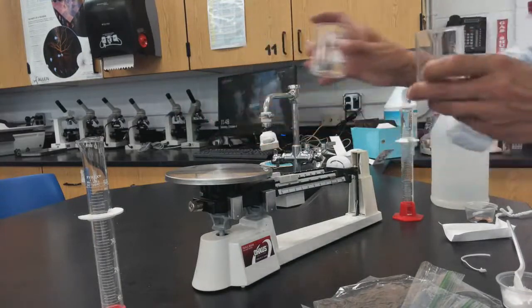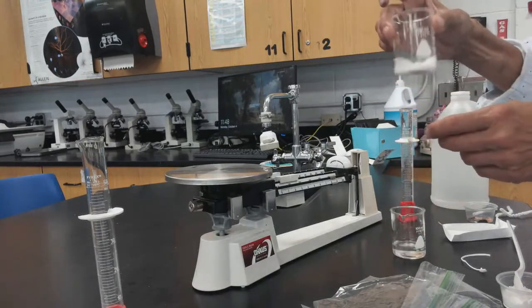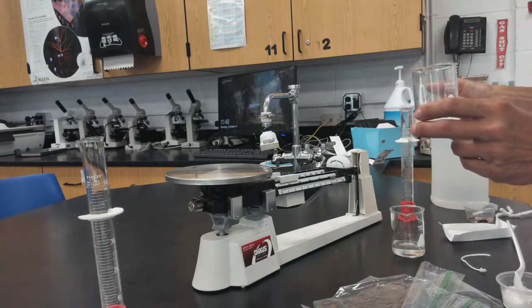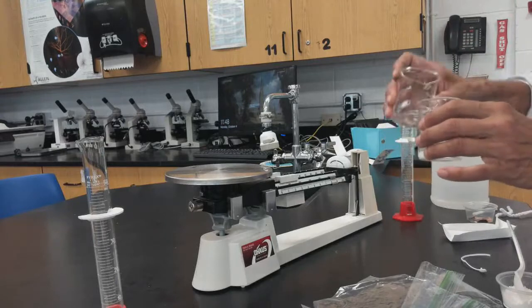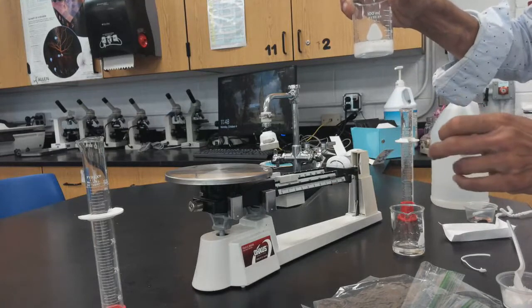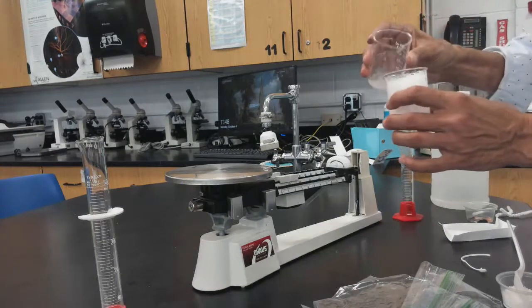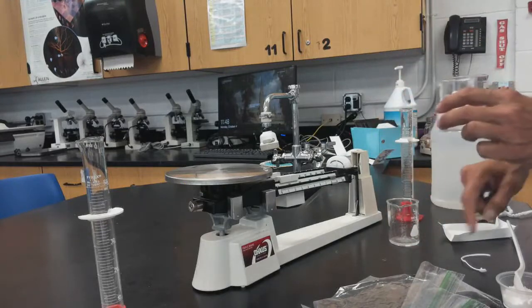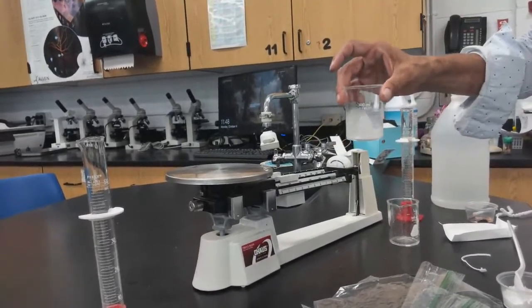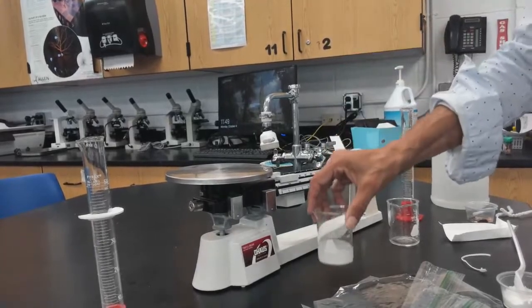Not on the scale, you're going to add acetic acid slowly to the sodium bicarbonate. Do not dump it in all at once — you'll overflow and lose some of the fluid. You don't want that because you'll lose mass. Add it slowly and gently swirl it, waiting for the reaction to finish.